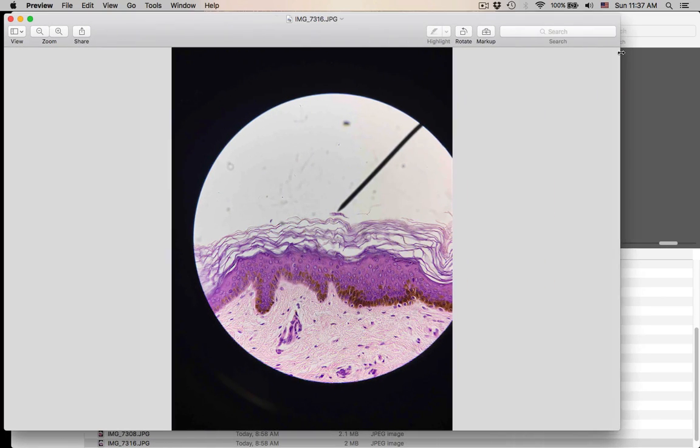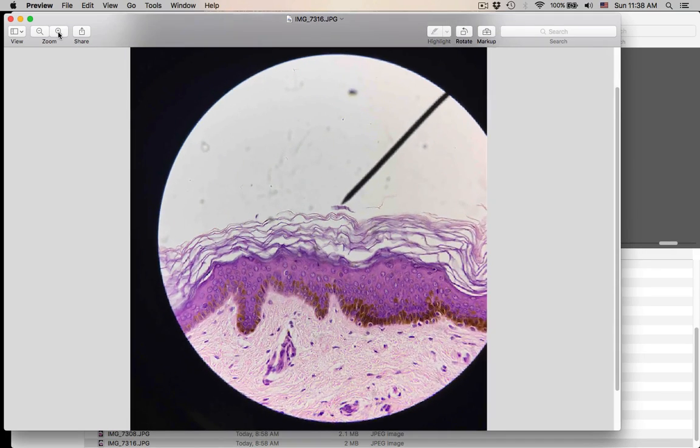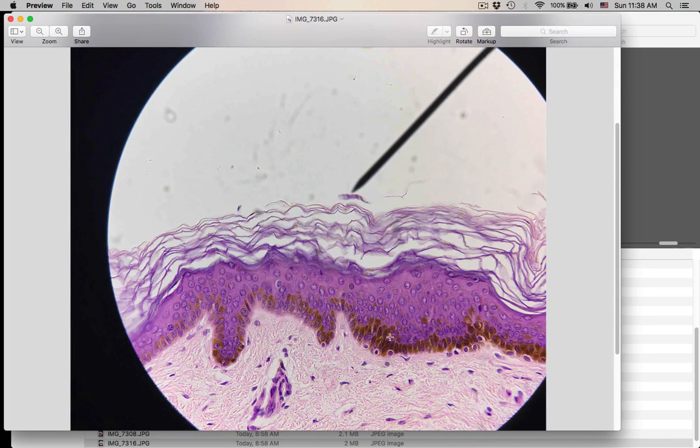Now on this slide, the pointer's in the lumen. You should kind of know where you are. I want you to tell me, you see this dark pigment down here? Number one, I want you to tell me the name of this bottom layer. You should know where you are here. What is the name of this bottom layer? This is 31, the name of the bottom layer.